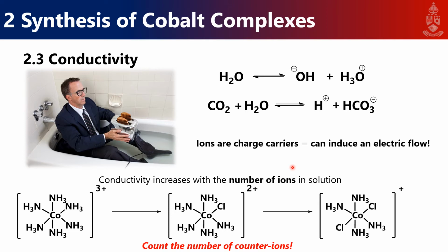So we have the characterization as well as the conductivity measurements. The conductivity measurements are also a confirmation of where these ions are. Are they part of the complex, or are they counter ions? You need to read the prelude or introduction to the experiments carefully to understand what Werner and Jorgensen were arguing about initially.